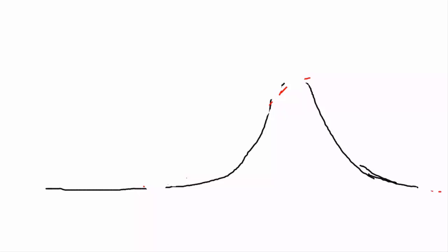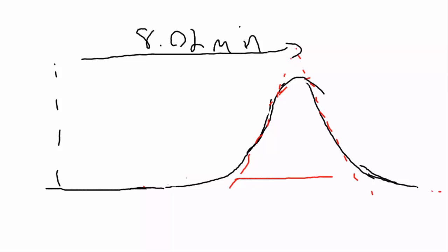But if we have a symmetrical peak and we know the retention time, I'll try and redraw this, and we're saying for this problem that the retention time, the time after injection, is 8.02 minutes. We also need to know either the base peak width or the half peak width. In this case we know the base peak width, so again we're going to draw tangents to make it a triangle and measure the width at the baseline, and this has to be in minutes, so if it's in centimeters you need to know the chart speed.